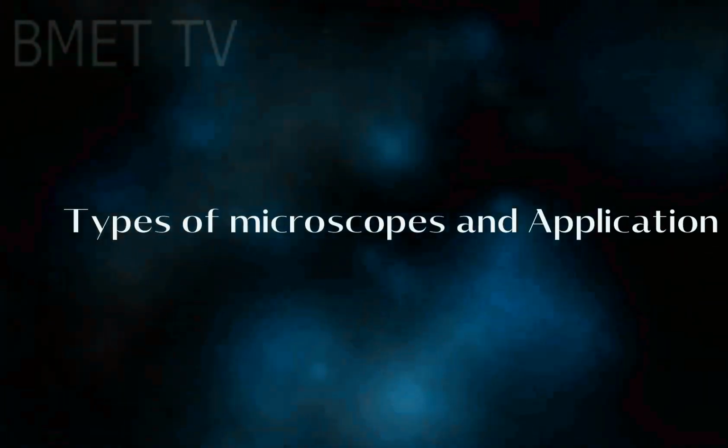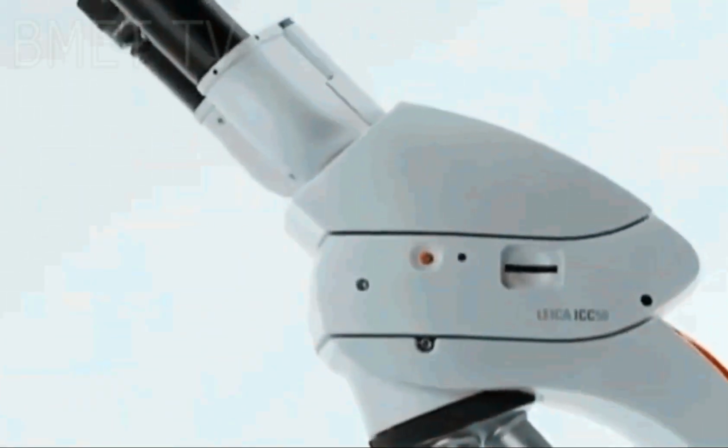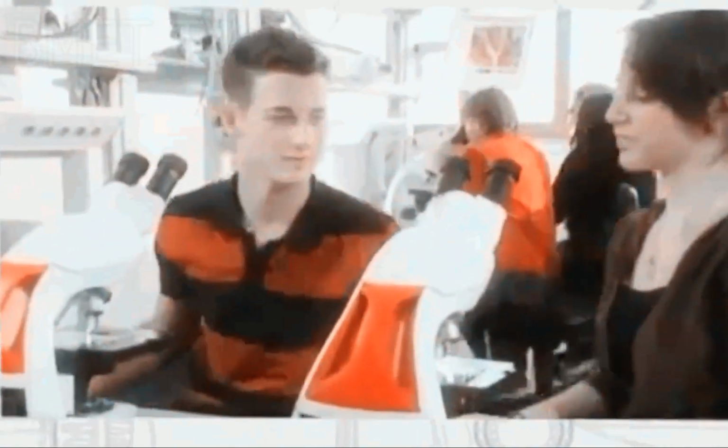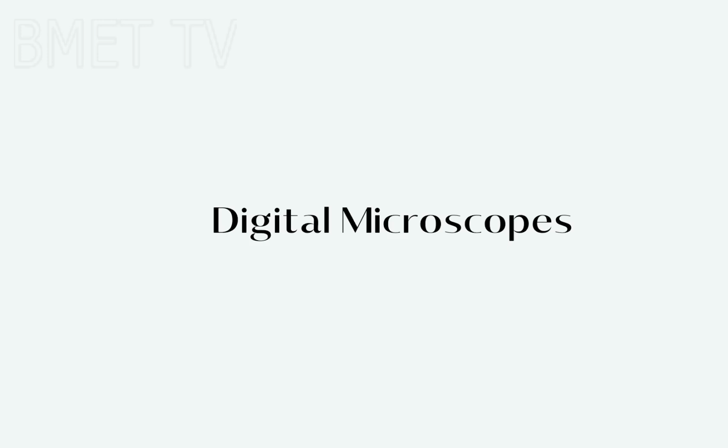Let's end the video with types of microscopes and application. There are several different types of microscopes used in light microscopy, and the 3 most popular types are the compound, digital, and the USB computer microscope. Some types are best suited for biological applications, where others are best for classroom or personal hobby use. As we have already seen and learned about the compound microscope, let's look into the digital microscope.